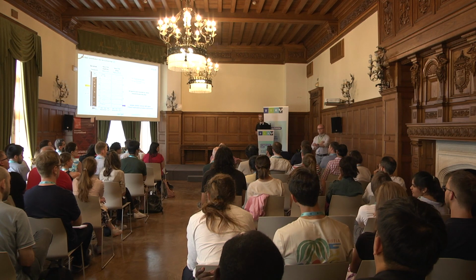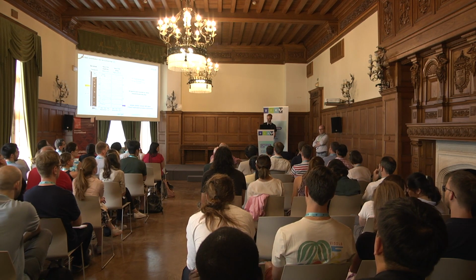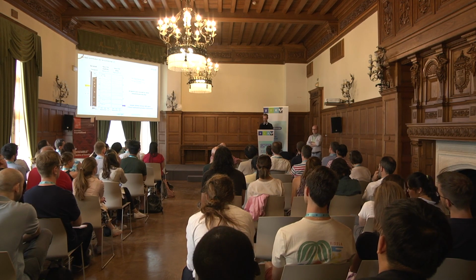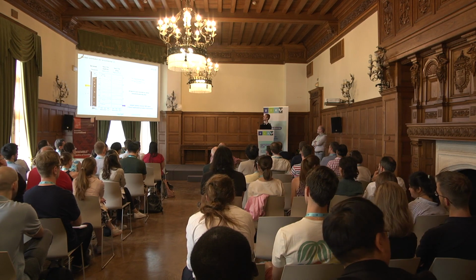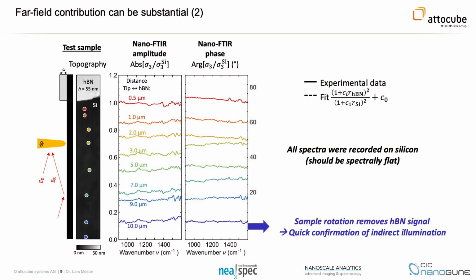Does it matter which harmonics are used for the normalization? Do you have recommendations? Which is best to use, which to avoid? I recommend dividing a higher one by a lower one, because then the peaks are still peaks and not dips.